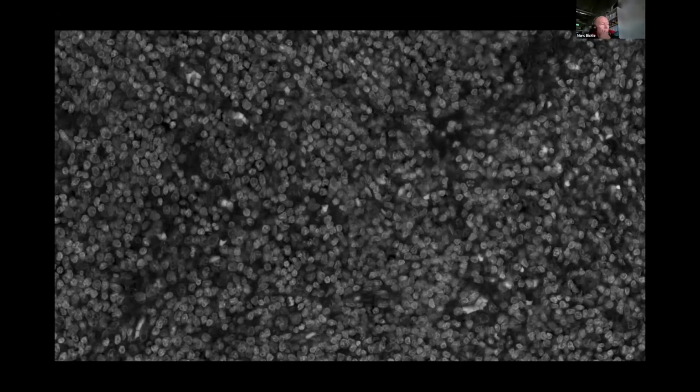That is super interesting, and we haven't implemented such an approach, but it's certainly interesting to think: okay, you have 3 annotators, and the actual ground truth is the consensus vote, and wherever the cell annotations differ, those are probably the hard cases and the ambiguous cases.